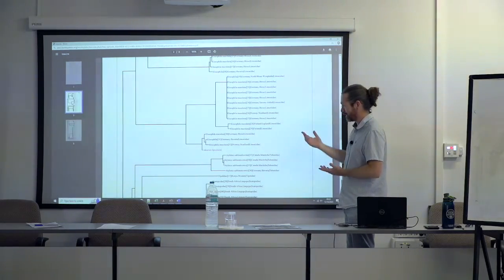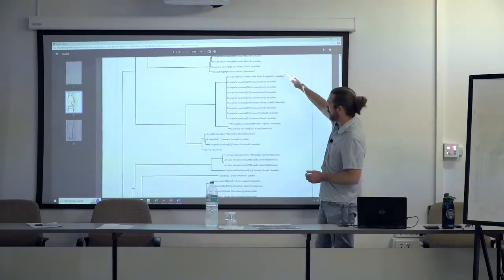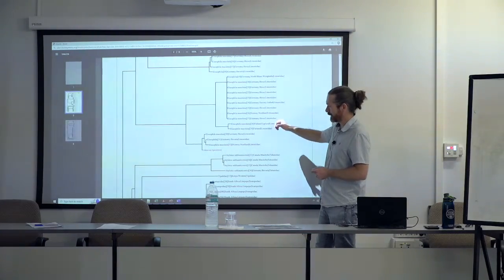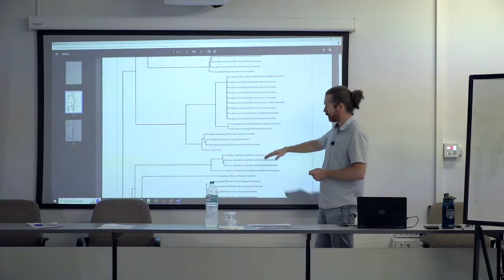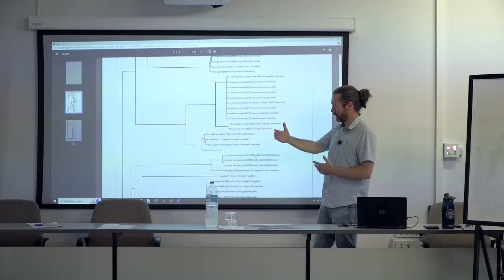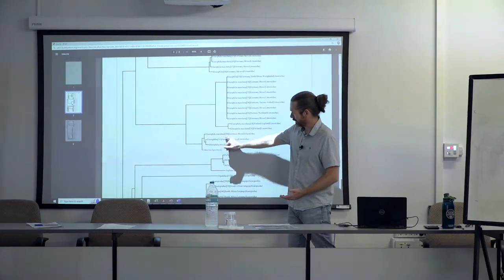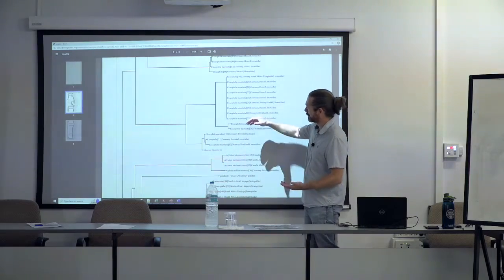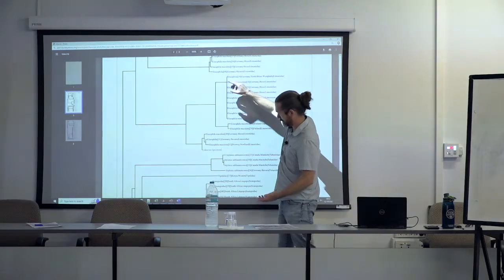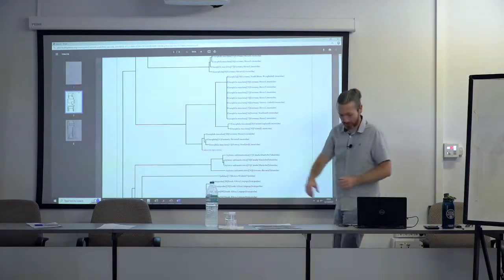And you can see here in that example, that specimen is your unknown specimen. In these trees, these are all black because they are Bold data, the data that's loaded up to Bold. However, if it has sucked in data from GenBank, those would be blue. And the only reason there is because there's different metadata standards for NCBI versus Bold, so that you can see that visibly. But it's nice to see, oh, look, it comes really closely to this maculata clade, and the nearest relative is also maculata over here. And then there's quite a big distance to, hey, look, another maculata. So maculata maybe a couple of hidden species. Who knows? We should go look at that. And then, yeah, I'm not going to go through the whole tree.